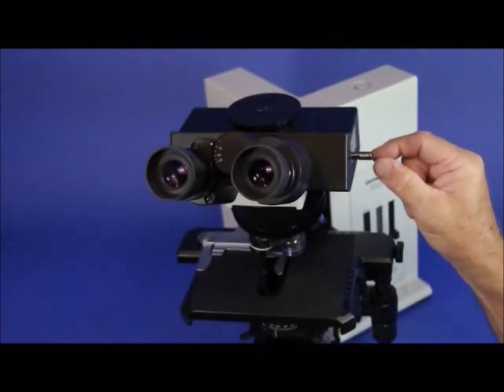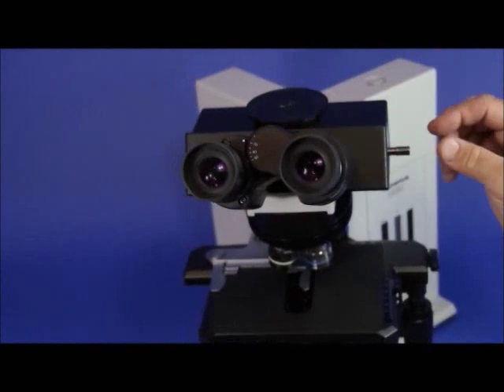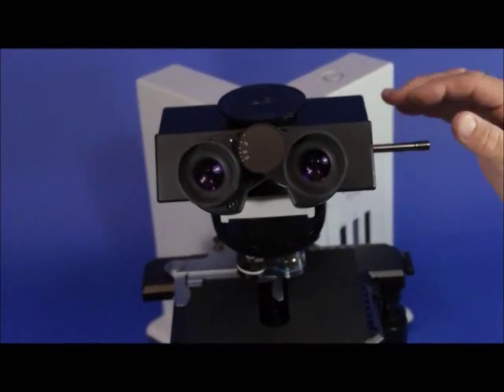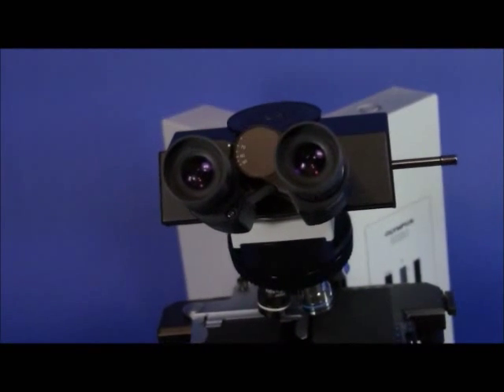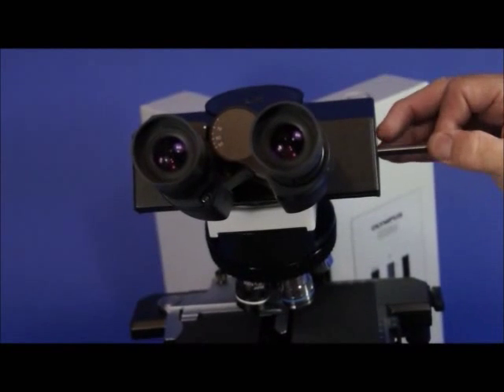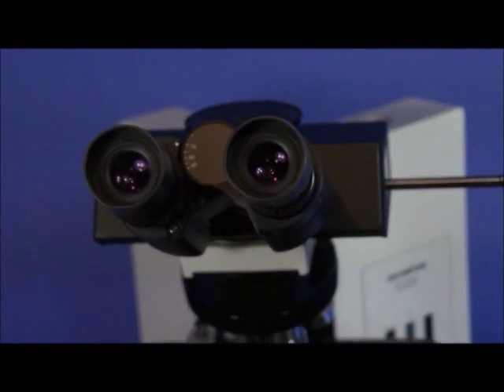When the knob is pushed all the way in, you have 100% of the light to the eyepieces. When it's in the second position, you have 20% of the light to the eyepieces and 80% of the light to the camera. When it's pulled all the way out, you have 100% of the light to the camera.